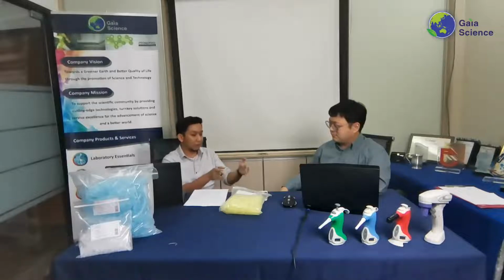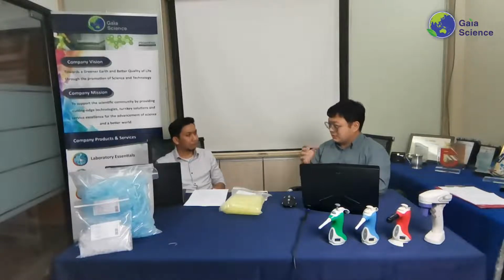So what are the things that you think might be different between sterilization through autoclave and the one that's sterile when we get it from the manufacturer? Okay, so when it's sterile from the manufacturer, then you know that you can ready use already. Now, you can say, yes, I can just take the bulk and autoclave it myself as well. But you got a few issues as well, actually. Some of them are not autoclavable the second time. So there is no guarantee whether the shape, the build of it, even the performance, aspirating or dispensing the exact amount, would still be the same or not, right?